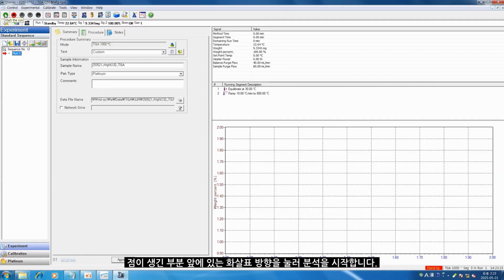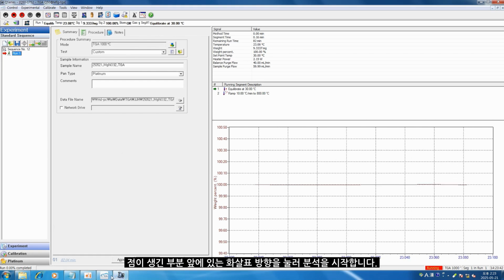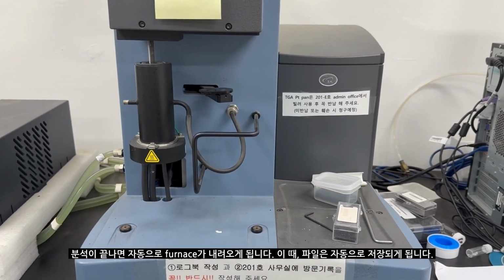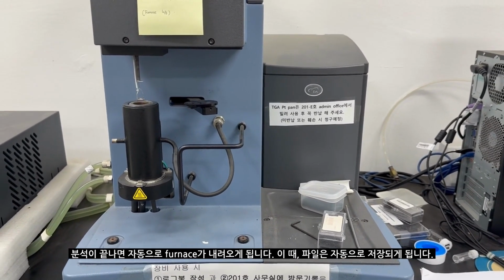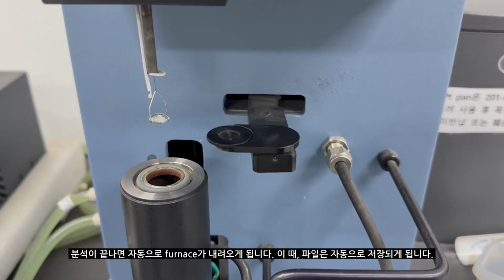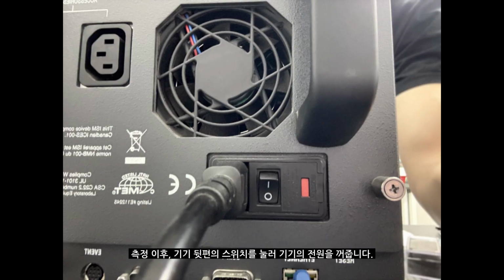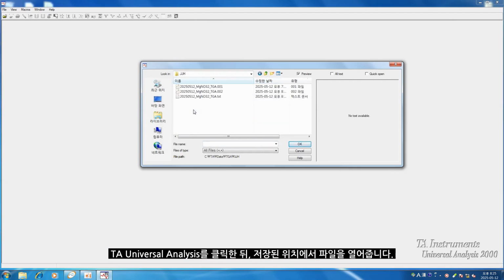Click the arrow in front of the dot spot to run the program. After the measurement, furnace will descend automatically. At the same time, file will also be saved at the storage location. After the measurement, switch off the device. Click TA Universal Analysis and open the file at the storage location.